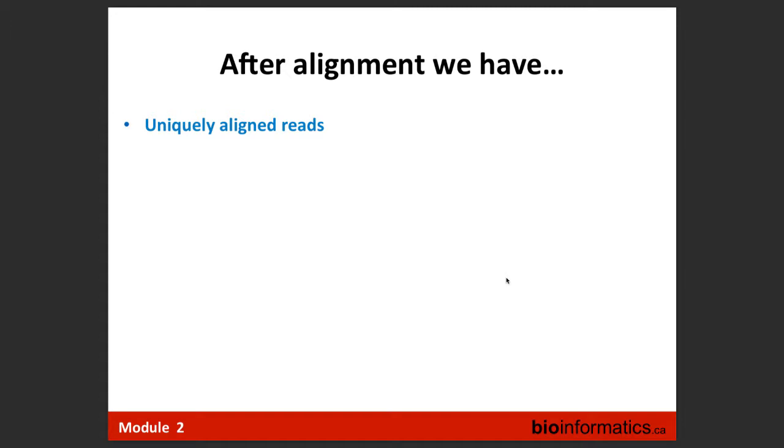Yes, that's another thing. If we have an adapter in every single read, there is like an 11-mer which doesn't belong to the genome. That's a problem. Why would a SOLiD read not align to the genome? Well, because it doesn't use the alphabet. It has the colors, right? It has these numbers. Yes. Yesterday I did this accidentally. I didn't look, or the day before yesterday.